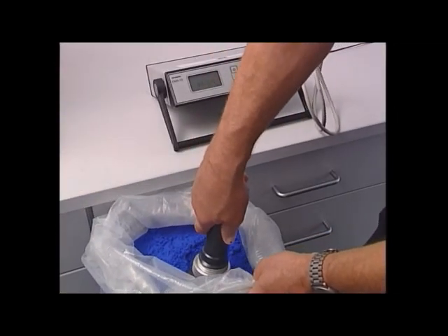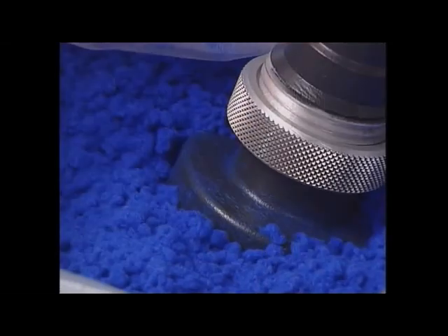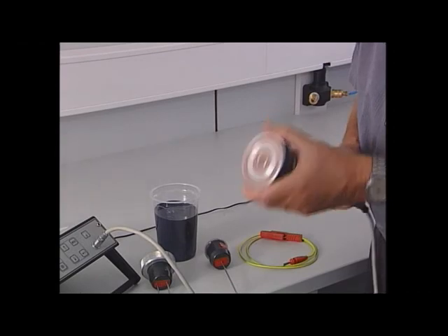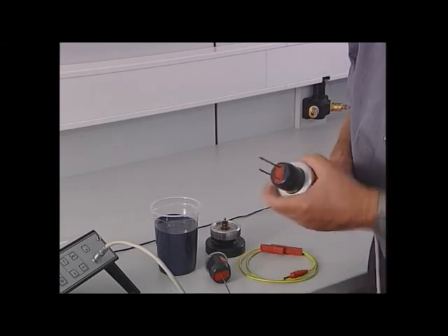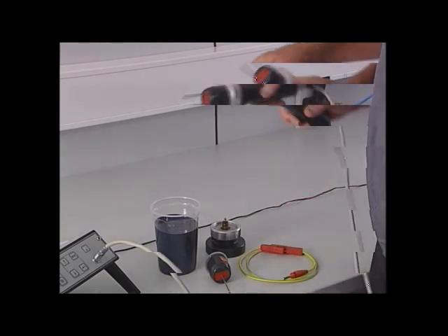With the resistance measuring equipment, called a textometer, the conductivity is measured on a scale. Instead of the Flock plate electrode, one can also screw on the two-needle electrode for measuring the conductivity of the adhesive.